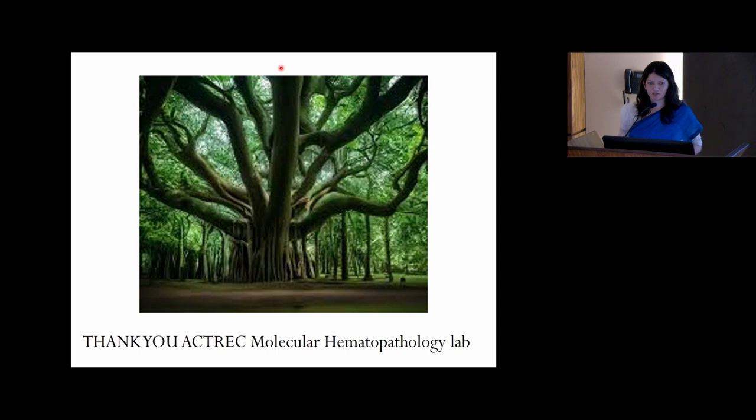So any questions? Shivangi, a common question that people have, because you have seen in our lab Illumina data and now you are seeing Ion Torrent data as well. So many people who are starting will have this doubt, right? Whether they should go for Illumina or Ion Torrent. So what will you say about that?